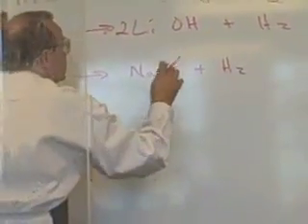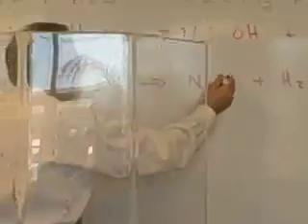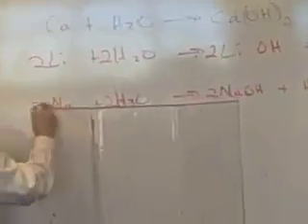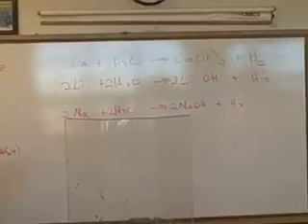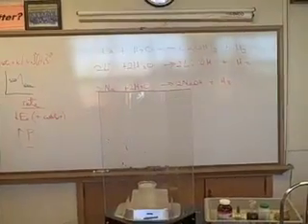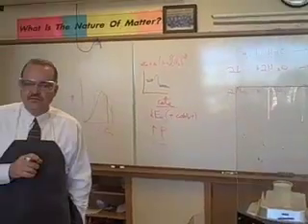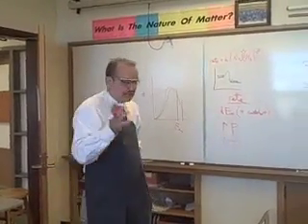It's the same reaction. We've got the sodium hydroxide plus the hydrogen balanced the same way. Which one? We saw more energy come out of the second one, but that's a little bit misleading. Where do you think the energy is coming from? What was that explosion? It's gas. It was combustion of what?